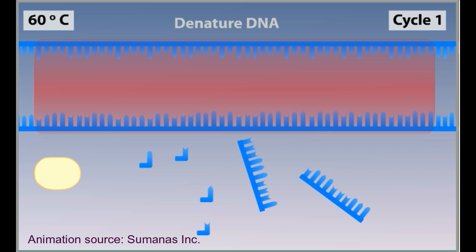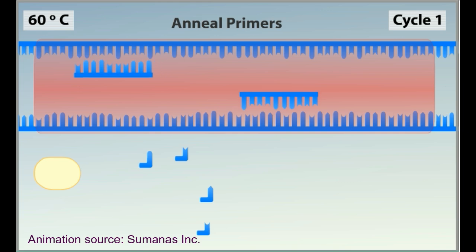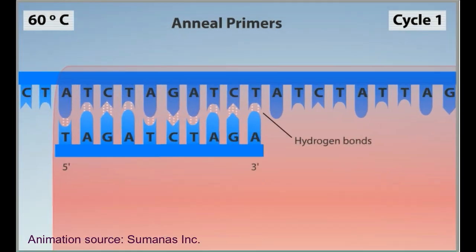After denaturing the DNA, the temperature is reduced to around 60 degrees so that the primers can form hydrogen bonds, or anneal, with their complementary sequence in the target DNA. Note that the primers and the target DNA follow base pairing rules. An adenine pairs with a thymine and a cytosine pairs with a guanine.